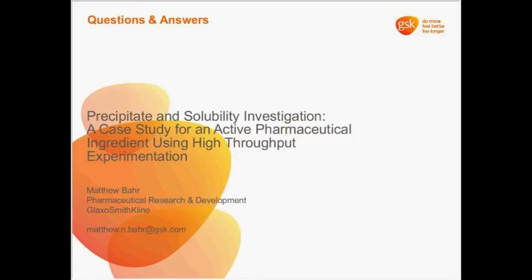That's a good question. So what we're looking at here is on our Freeslate robot, we have 4-tip needles, and we also have 4-tip pH probes. And what this means is we can do dispensing with 4 tips at a time. We can do filtering with 4 tips at a time, I should say. And we can also measure pH at 4 tips at a time. So I tend to run experiments in replicates of 4 or multiples of 4.